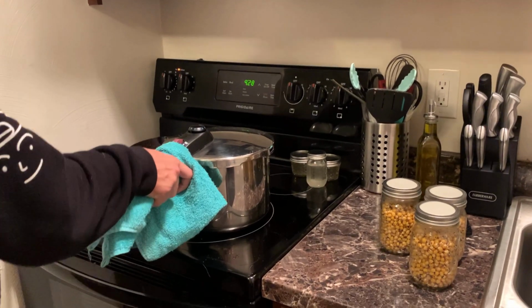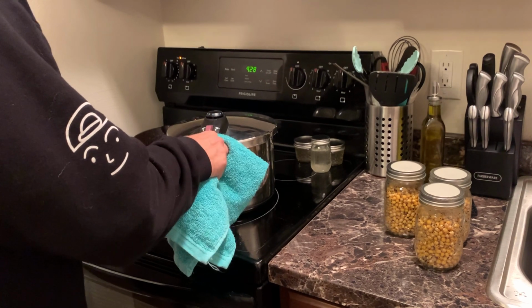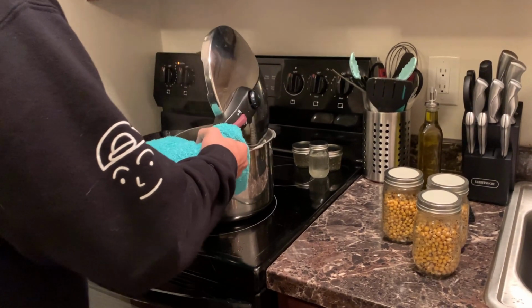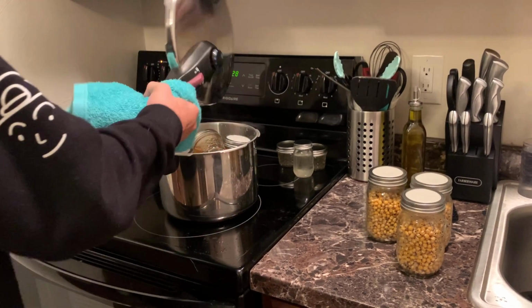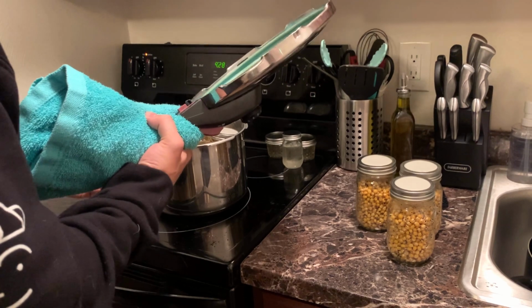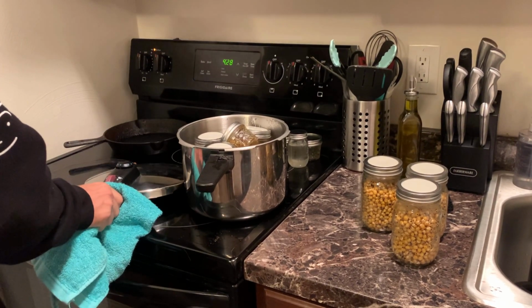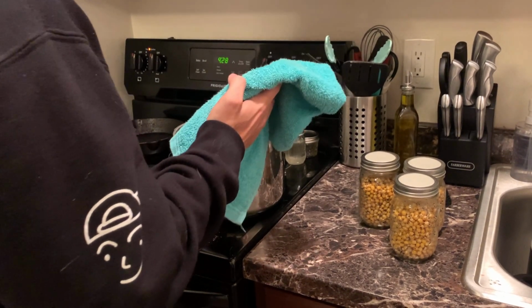All right, so now that we let all the pressure out, you can take the lid off. You gotta be careful because this is gonna be really hot. So now these jars are ready to get pulled out, and then you just let them cool. Be very careful. Use a rag when you do this because these are going to be extremely hot.